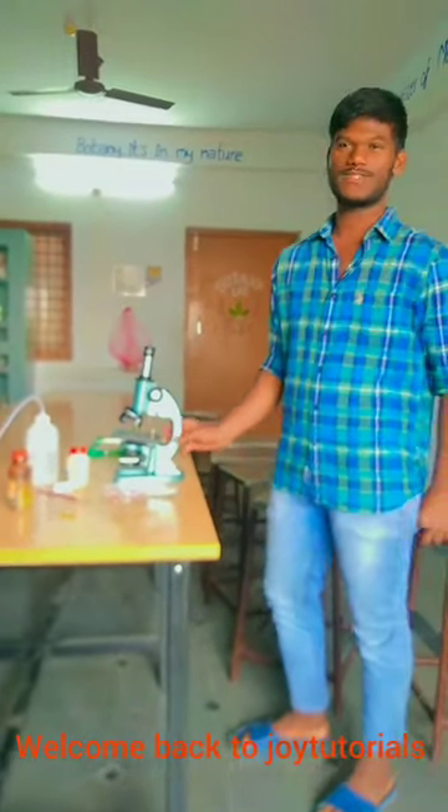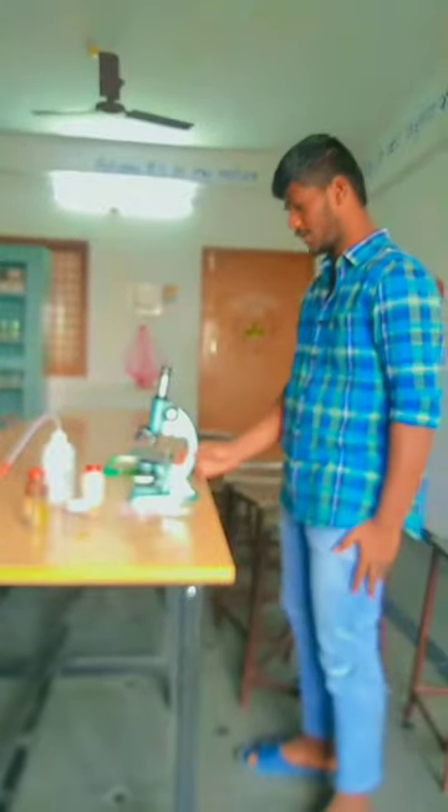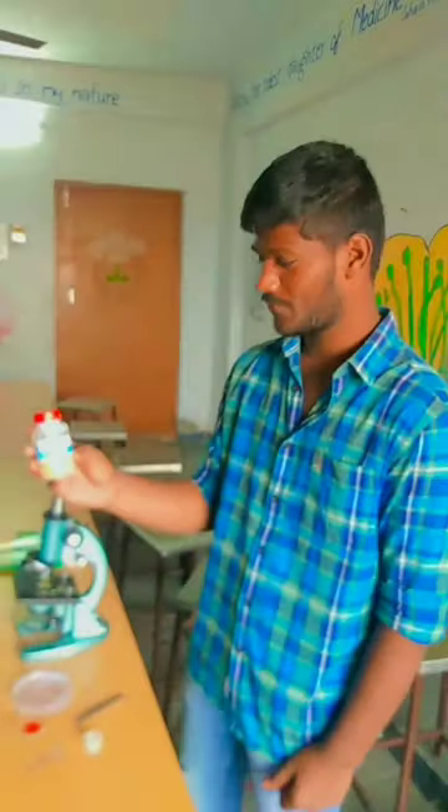I am Vishnurash from 2nd year PC. I am studying in Kandukur Social Welfare. Now we are seeing, I am explaining about monocot stem.